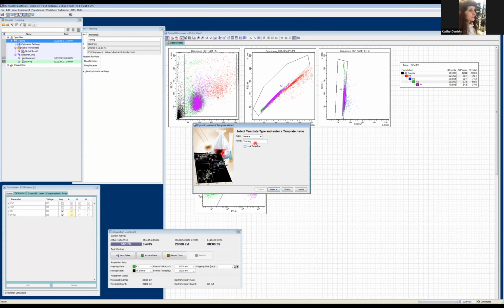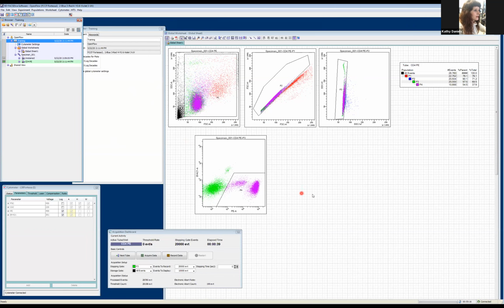Once you do that, if you have it under general, it'll go specifically there under general. And when you go to create a new experiment from the experiment window right here or the tab right here, it'll give you this as an option. So if I hit training, and I do 05-22-20 and hit finish, it now creates that experimental template for us.